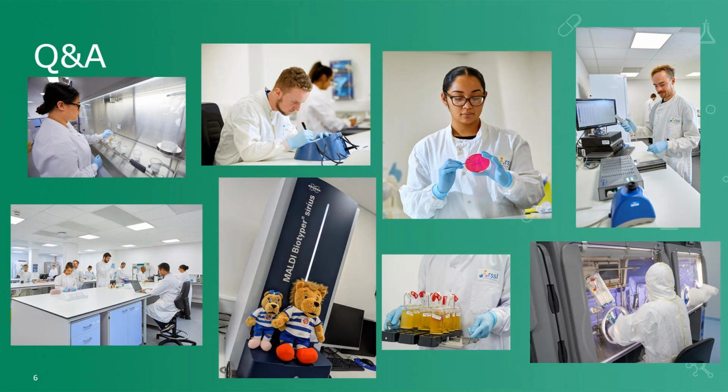And then as part of continuous improvement, obviously try and eliminate the fungi by trying to assess what that source might be, because it might be a structural issue. There might be some fabric damage. There might be something with an air filter, or it might be something being transferred into the room. So low level, wouldn't worry unduly if it's not getting through, but you still seek to eliminate that over time.